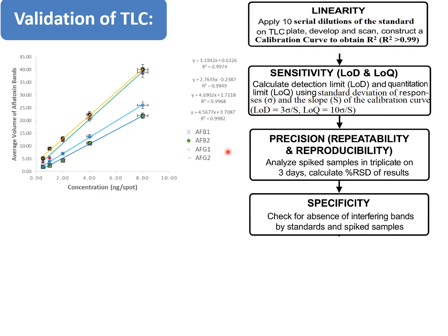Therefore, specificity is evaluated in TLC by checking for the absence of interfering bands alongside the standard and spike samples.